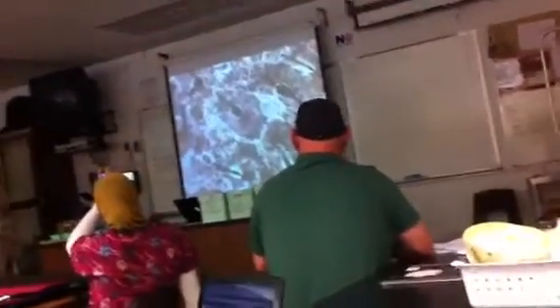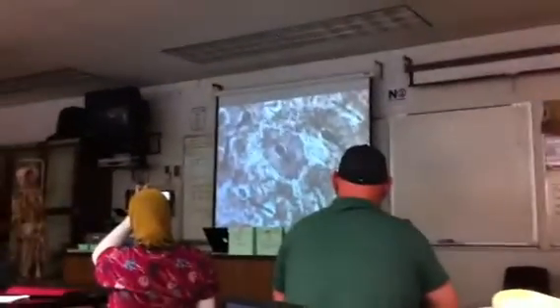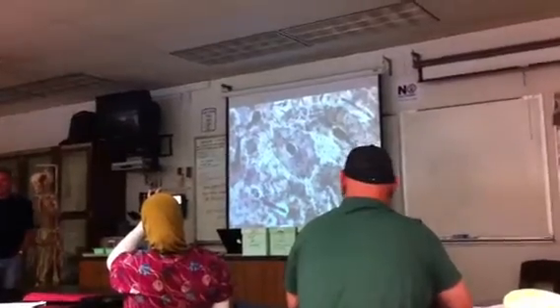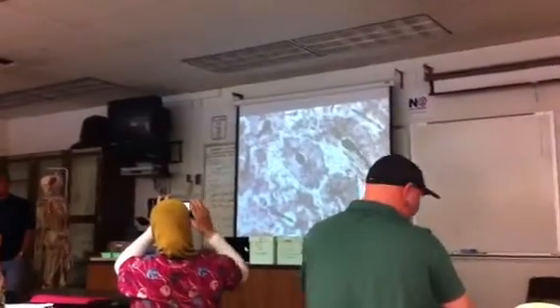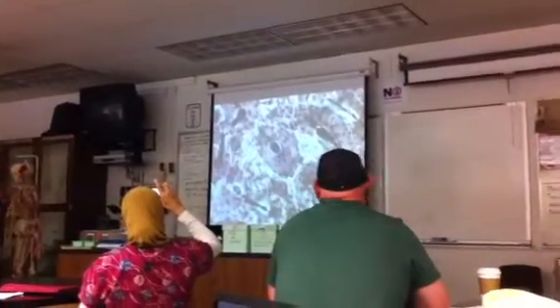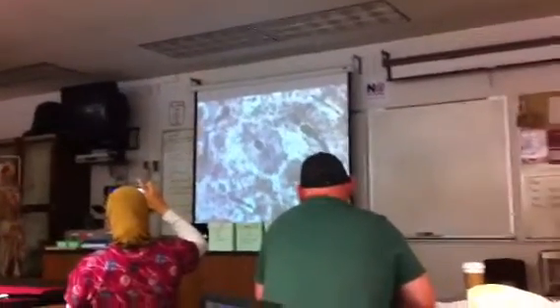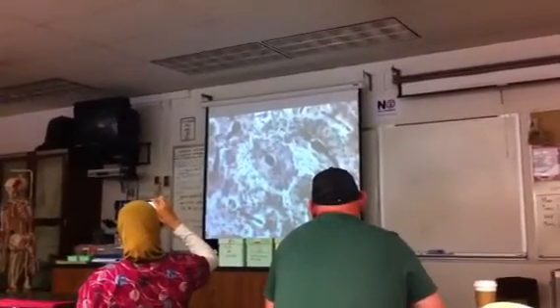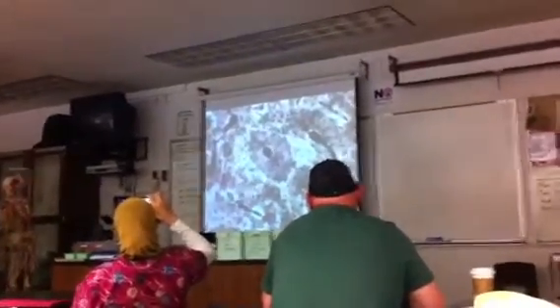And then there's another little osteon right here, another one there, and another one over there. And you can see the little black dots in between, which are arranged in not really a circular pattern, but that's the interstitial lamellae. That's the bone which fills in the spaces between the actual round osteons. So all this filler material there is the interstitial lamellae.